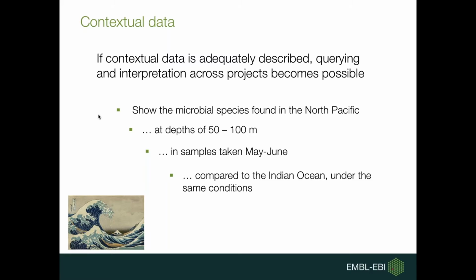The problem is, we know scientists don't like capturing and recording this data. We know it's boring. What they want to do is science. But I hope you will get this data and record it, because it makes things much, much more useful. But the problem is, if you say to people, describe your sample, and just give them a text box, they can go a little bit crazy.